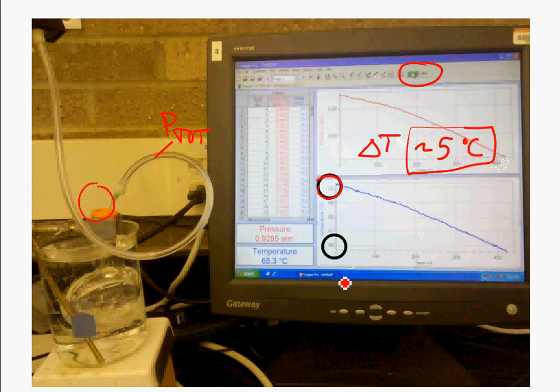And in this example experiment, as you can see, it took about 400 seconds, so that's 5 or 6 minutes. And again, remember, our temperature drops because after we've gotten up to that 70 degrees, we shut off the hot plate. It's still stirring. We still have our stir bar spinning the water in here to keep it all equilibrated, but the beaker is slowly cooling off just by the ambient air, so we're not going to have to chill it with ice or anything.